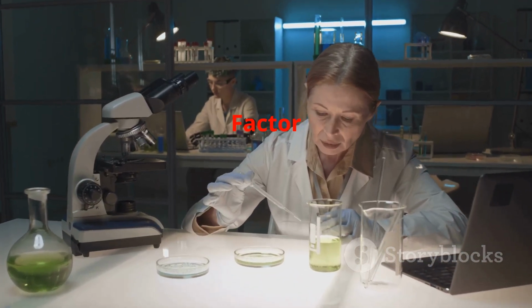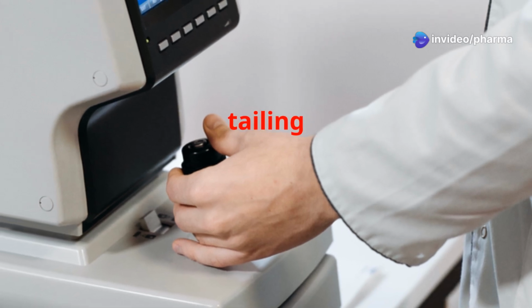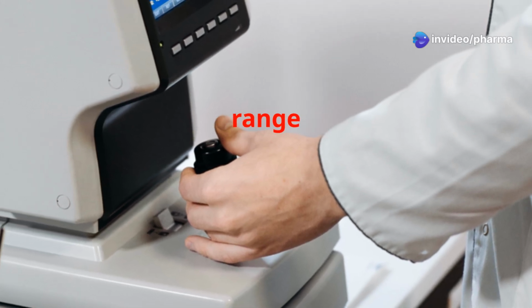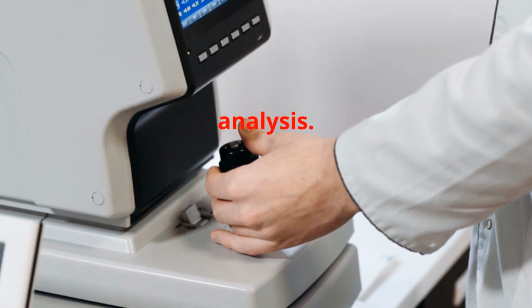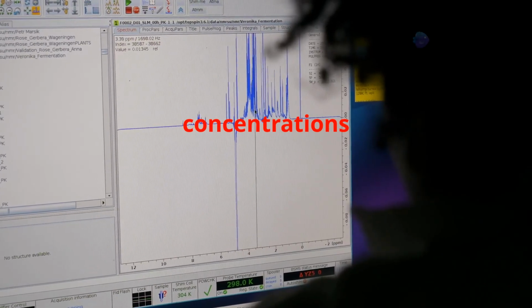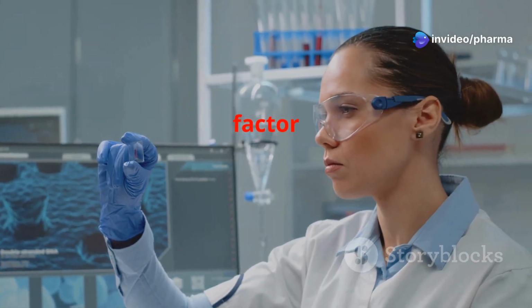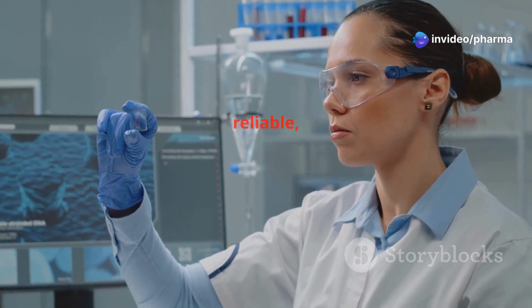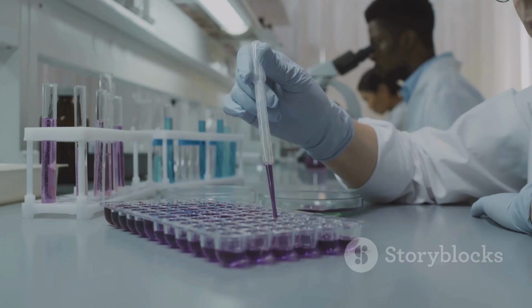Calibration and tailing factor. During HPLC calibration, ensuring that the tailing factor is within an acceptable range is crucial for the accuracy and reliability of quantitative analysis. Calibration curves are constructed by plotting the known concentrations of analytes against their peak areas or heights. If the tailing factor is too high, the results may not be reliable, and the method may need optimization or troubleshooting.